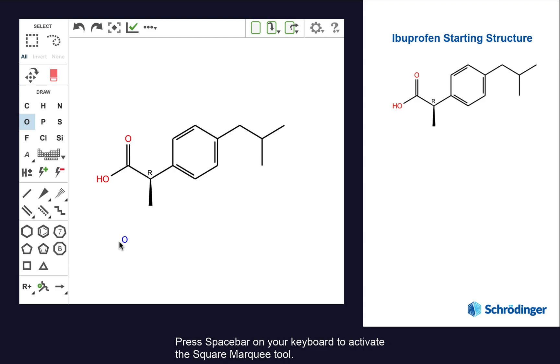Press spacebar on your keyboard to activate the square marquee tool. This tool can also be activated by clicking.